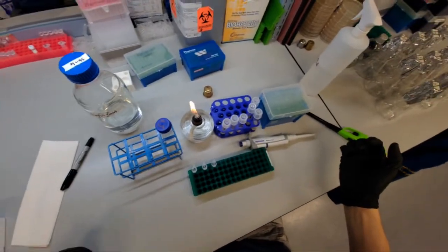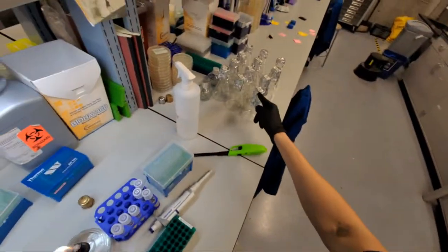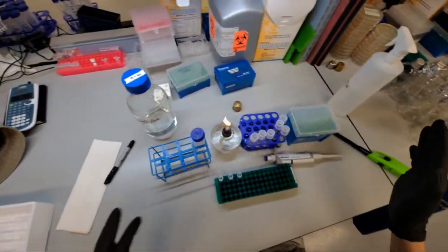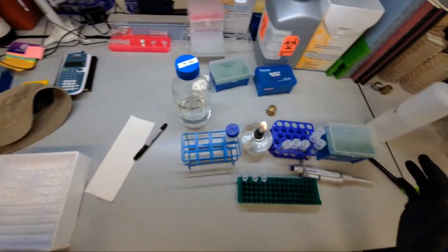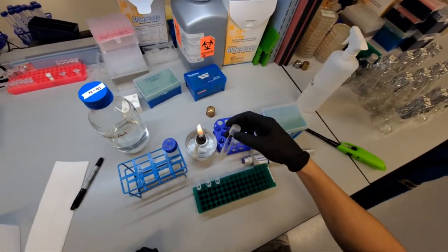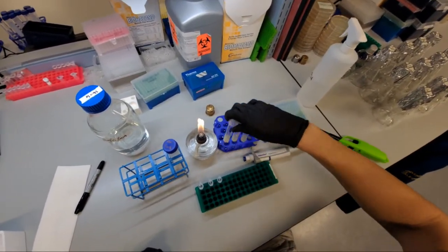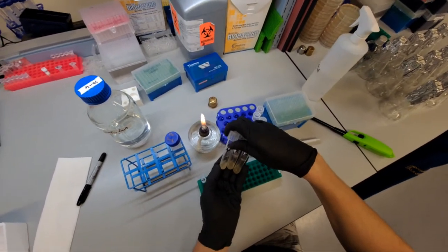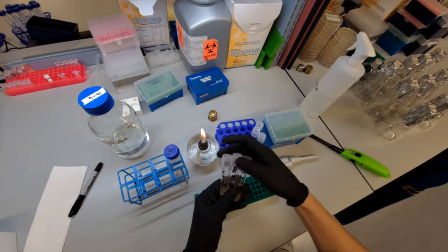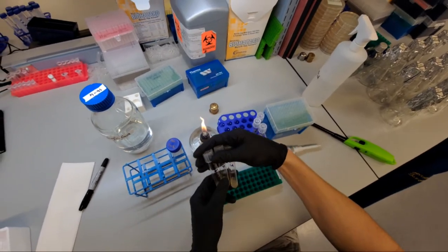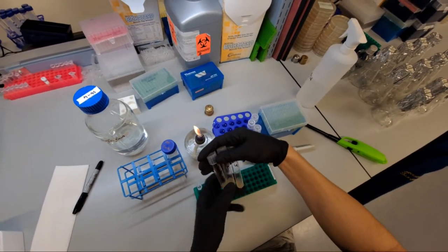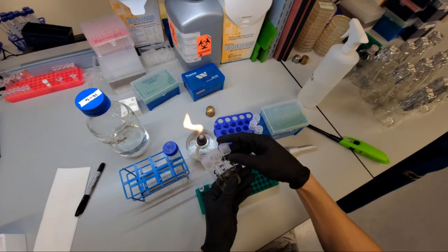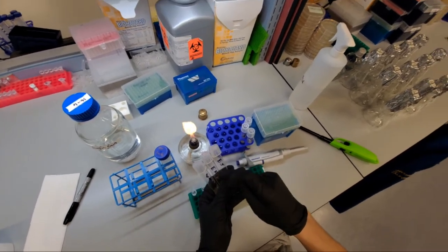So today I'm starting growth curves in these shake flasks. I've got a bunch of videos on the specifics of that if you want to see those. But basically I grew some mutant strains overnight in YPD or yeast peptone dextrose liquid culture. So this WT stands for wild type and then these letters are different genes that I've knocked out with CRISPR. So E is a gene, F is a gene.